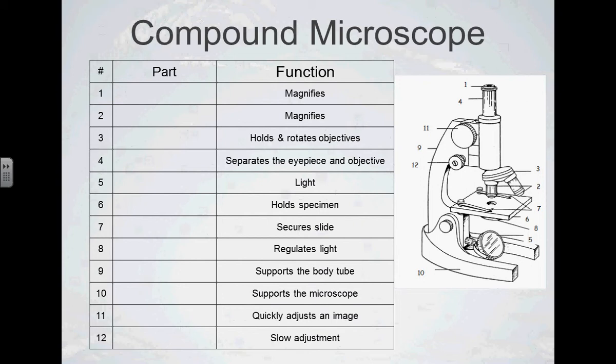First thing is where the lenses of the microscope are located. So when we're looking through this microscope, where are the lenses? Let's see. Jonathan? Oh, in the eye. Yeah, there's one up here. And then there's one down. Right. And then there are lenses here. This one's called the eyepiece. These are called the objective lenses.